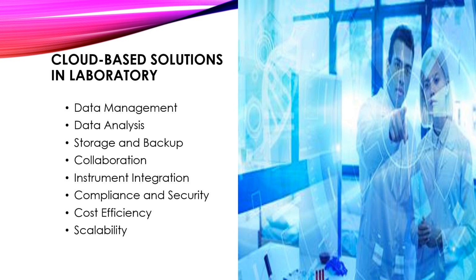The first is data management. Cloud-based laboratory information management systems allow laboratories to efficiently manage sample tracking, data organization, and workflow automation. These systems enable researchers to access data from any location with internet connectivity, facilitating collaboration and streamlining laboratory processes.